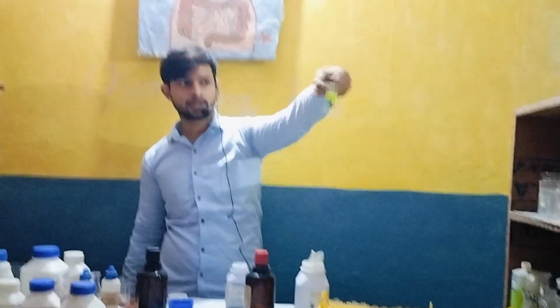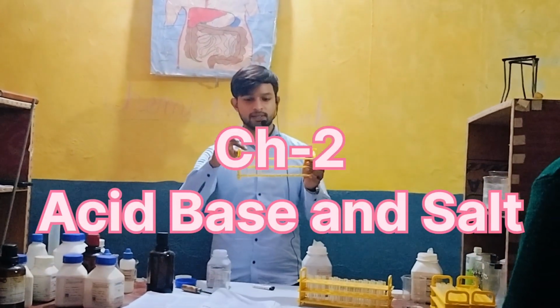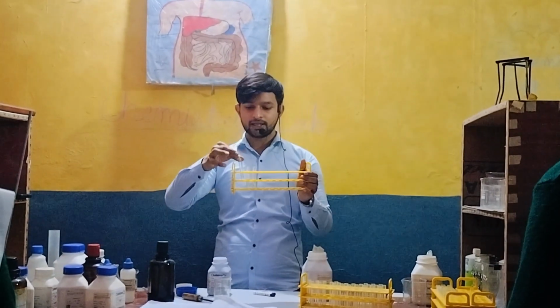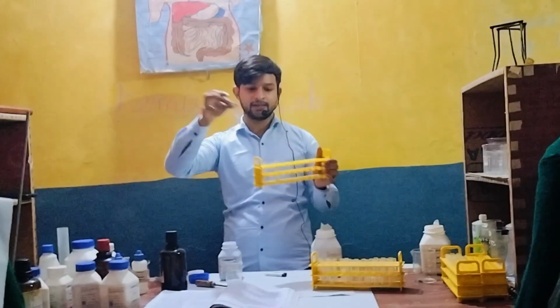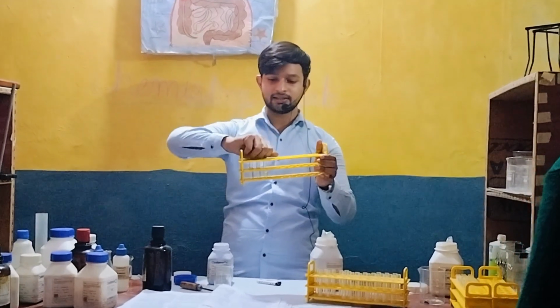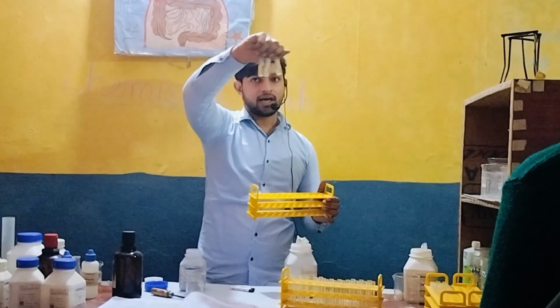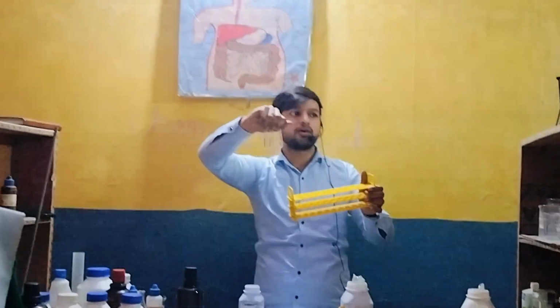Please stop. Acid, base and salt. Okay, so we have 3 test tubes in which I have taken water in one test tube. In another test tube we have base, that is sodium hydroxide NaOH, and in the third test tube we have acid HCl. Okay, as you can see in these 3 test tubes the color is same. The color is same now. Now how we will going to identify like in which test tube there is acid, base or water.